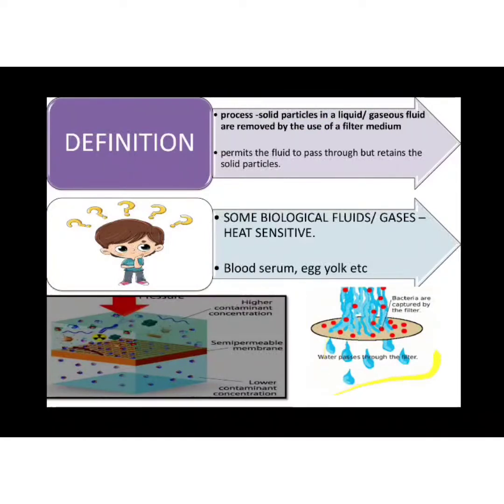Hence when I pass a solution which contains microorganisms through a filter pad, the microorganisms get collected on the filter pad and I get a solution, the filtrate, which is free of microorganisms.